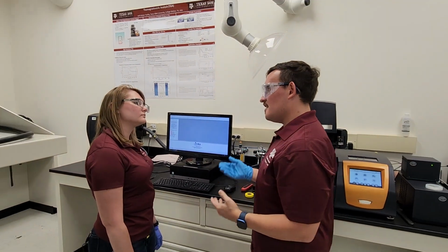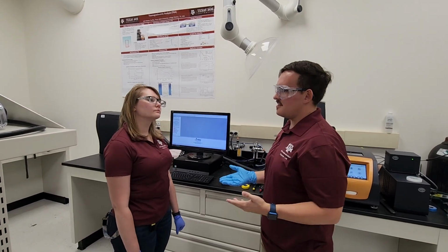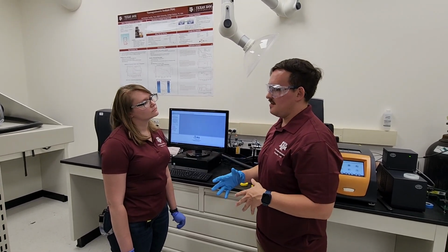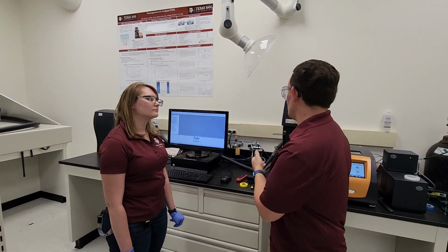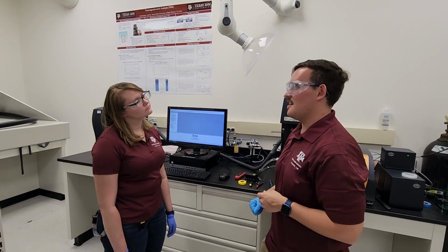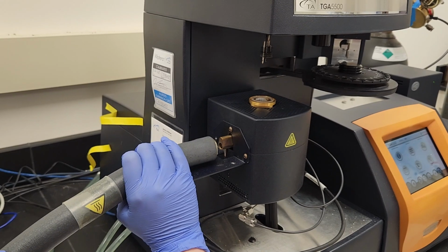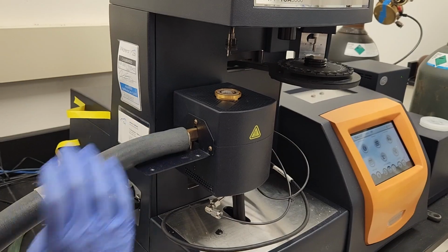Now, before we can actually insert the capillary tube into the furnace, we have to clean it out. So we utilize a process that just runs the furnace up to 1000 Celsius for a given amount of time until the unit is nice and clean. After that, we could start increasing the temperature for the capillary tube as well as the evolved gas port. After the furnace has been properly cleaned, the student could then carefully put the capillary tube into the evolved gas port, careful to not bend the capillary tube.